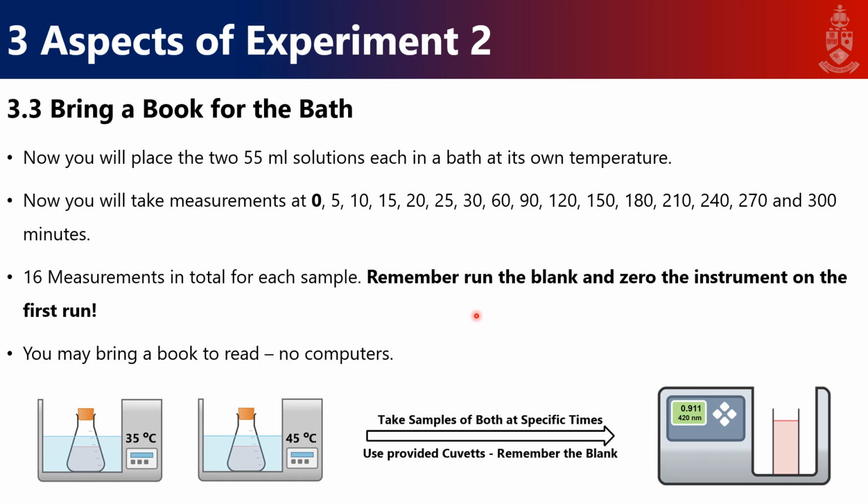You'll probably be using the one that is in Joel's lab, so you'll probably just blank on the first run, but in case you need to use the one in the instrument room, then you'll be blanking continuously throughout the day, throughout your 16 measurements. Okay, as I say, please bring a book. There are no computers allowed in the lab. You won't be allowed to go to the lecture halls because you need to monitor your Erlenmeyer flask with the little weights in the water baths over the period of decomposition.